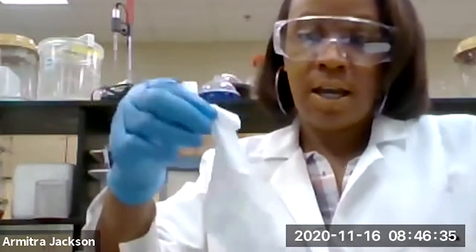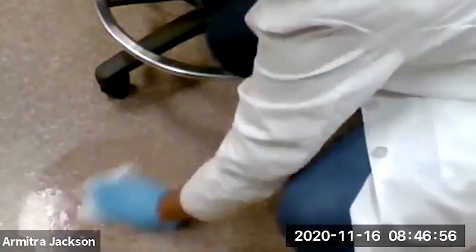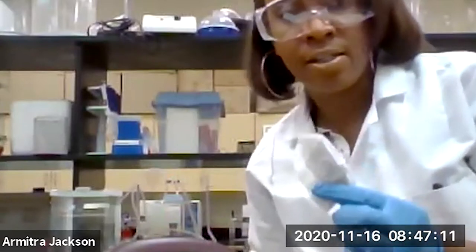You're going to take those Clorox wipes from your kit, open it up, take one out, and we're going to go back to that same area that we swabbed. You can see I've put the chair near it so you can see. We're just going to wipe this area, give it a few seconds to dry, and be sure you throw away your Clorox wipe in the biohazard bag that was in your kit.